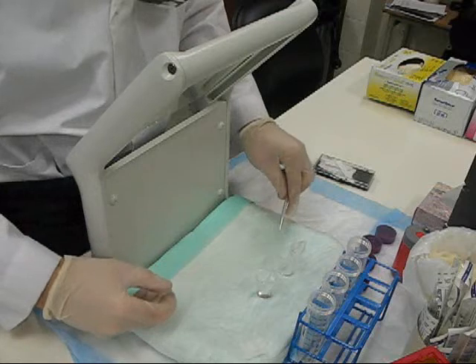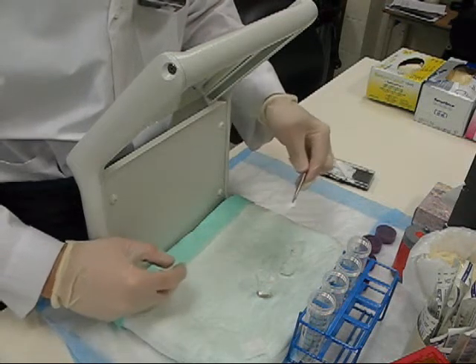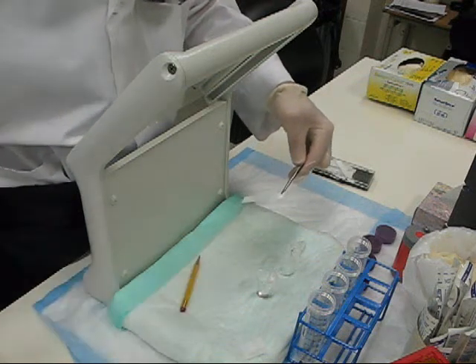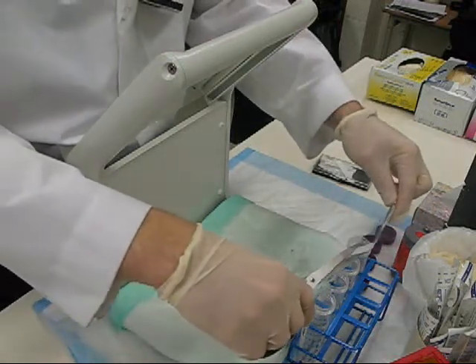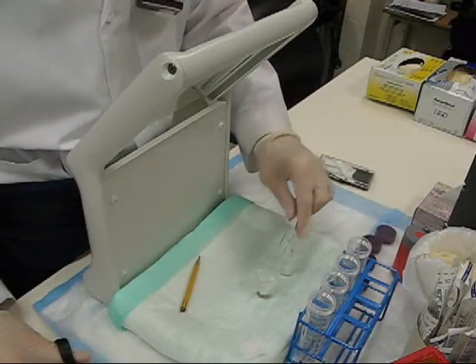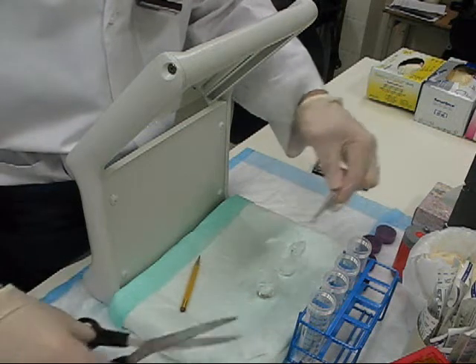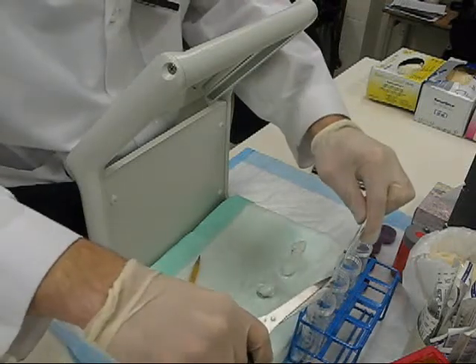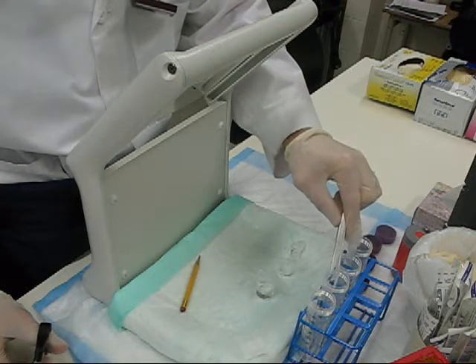As the solvent front is reaching the end — about a centimeter away, difficult to see but approximately here — I'll cut it into the corresponding tubes: Origin into the MEK Origin, and the solvent front goes into my Solvent Front container. Same with the saline: cut the Origin into the NACL, and the solvent front of the NACL goes into the Solvent Front container.